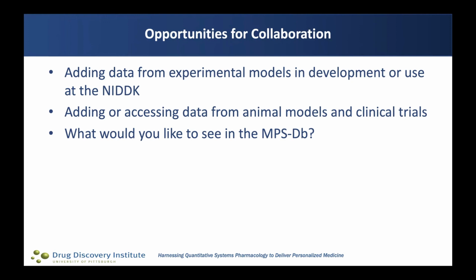do scientists from the community, are they able to put data in, or is this something curated that you yourselves do? Yes, absolutely. The preferred approach is to have the scientists put it in themselves once we train them. We're currently working with 15 different groups from NCATS that are funded on microphysiology systems development, organs on chips, and disease model development.